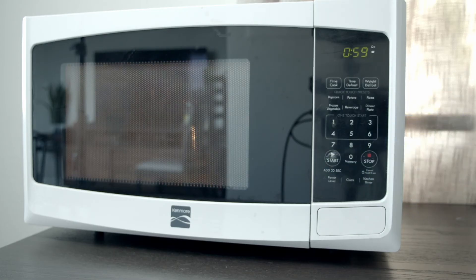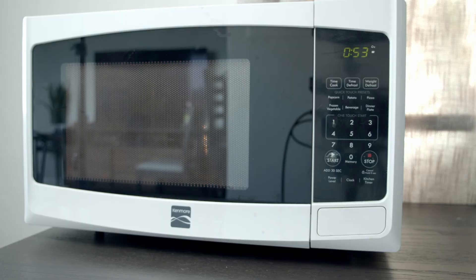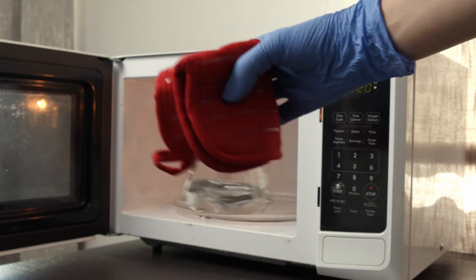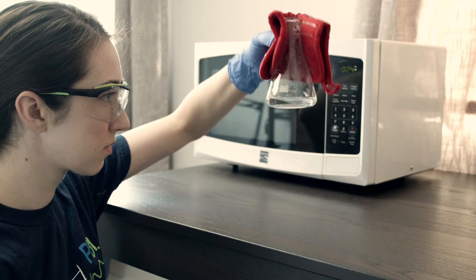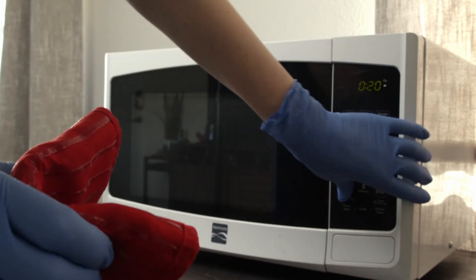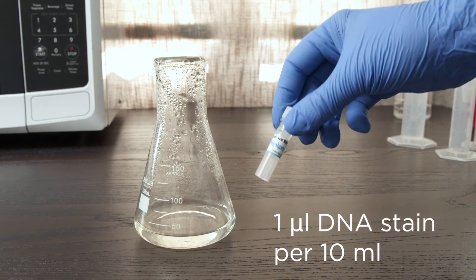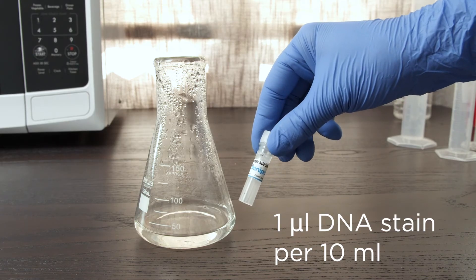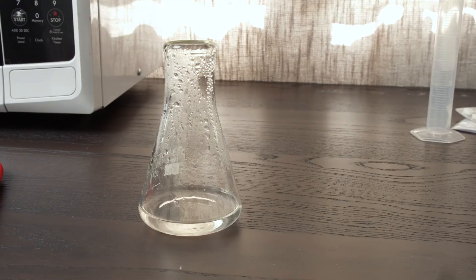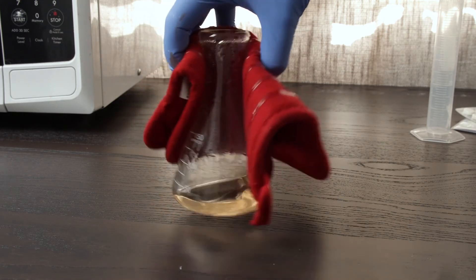Heat in a microwave for 60 seconds or until it boils and the solution is transparent. Keep an eye on it to make sure it doesn't boil over. Swirl using a hot mitt to make sure that the solution is well mixed. Make sure that the solution is clear with no remaining agarose crystals. If needed, microwave again for 5 to 10 seconds. You can also use a hot plate if a microwave is not available. Just make sure that the agarose tab is fully broken up before heating. Once your agarose solution is dissolved, add 1 microliter of a DNA stain like gel green or SYBR Green for every 10 milliliters of gel. Here, because we made a 25 milliliter gel, we will add 2.5 microliters of gel green DNA stain and swirl until completely mixed.